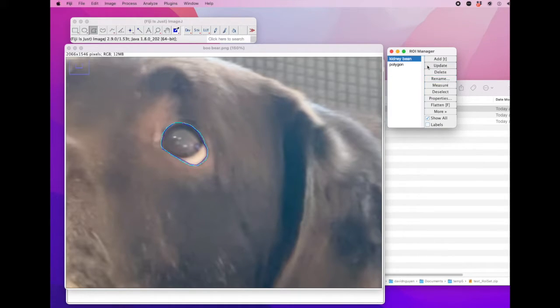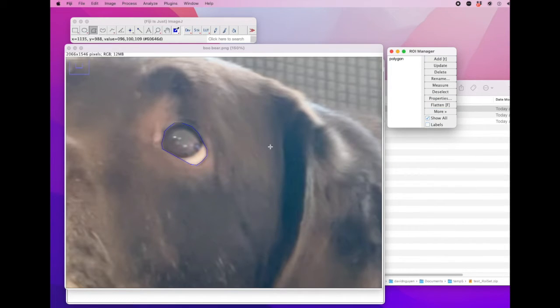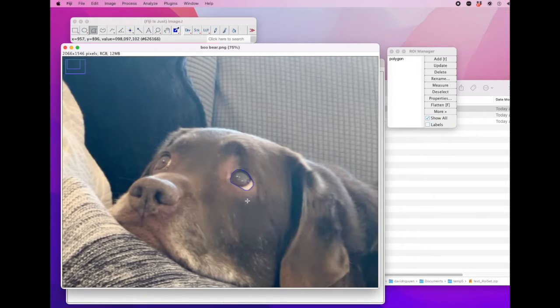Okay, so let me delete this kidney bean tool so that we only have this polygon tool, okay? So there you go. So here's the polygon tool, and I can save this ROI object, okay? And if I had multiple objects, I can save it, make sure everything is unhighlighted, okay, and click save, and it'll save as an ROI set file with a .zip, okay, suffix, right? So I've outlined it, but I haven't created a mask yet.